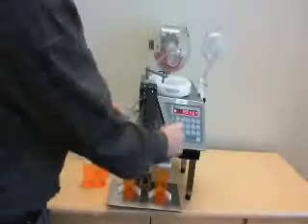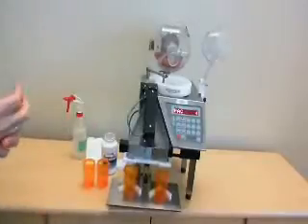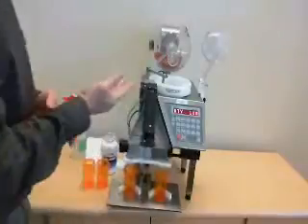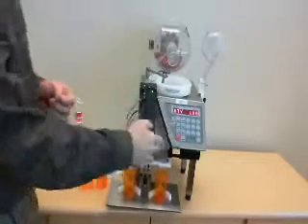Alright, we're going to set then the number of packs, which is going to be 4, or you can go up to thousands of them. And then the number of units, we'll go with bottles of 100. Again, you can go to up to thousands of this. And then we're going to hit start, and it's going to automatically count left side, then right side, left side, right side.